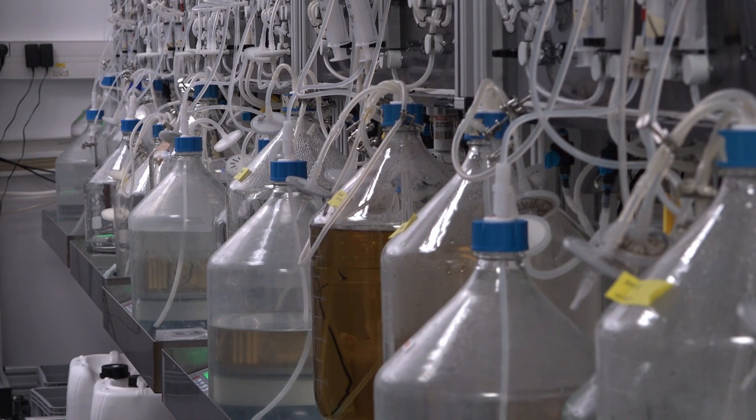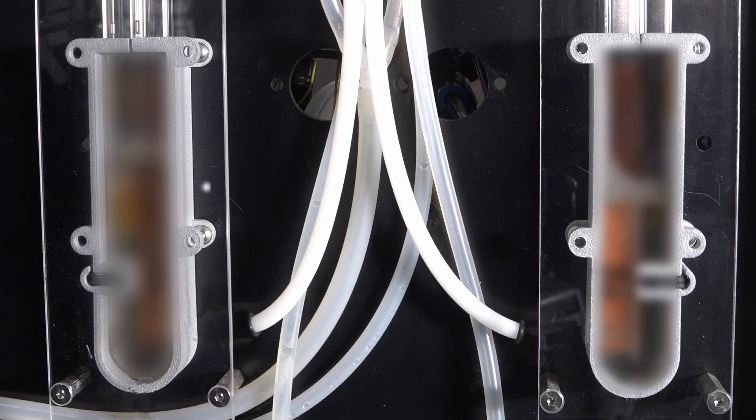At Altar we develop microorganisms for the industry and we have a unique technology called Genimat that performs adaptive laboratory evolution. The machine Altar created is a breeding chamber that automatically selects for the key mutations within a strain to achieve a goal.